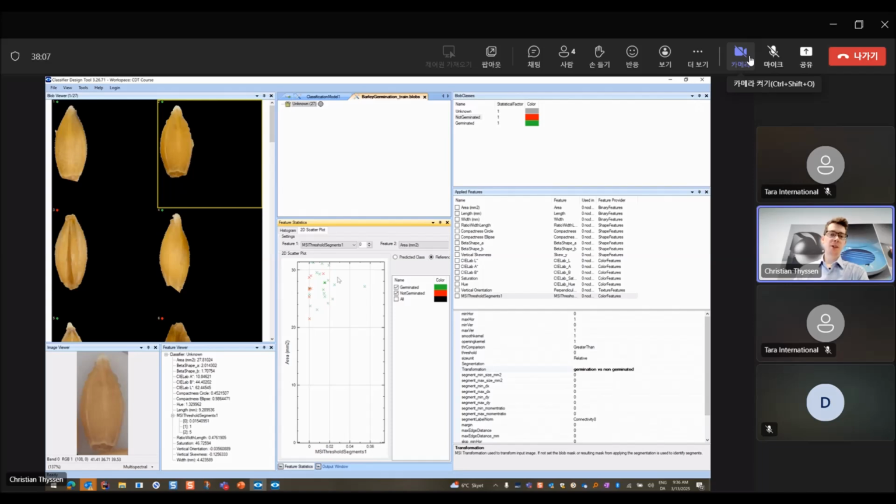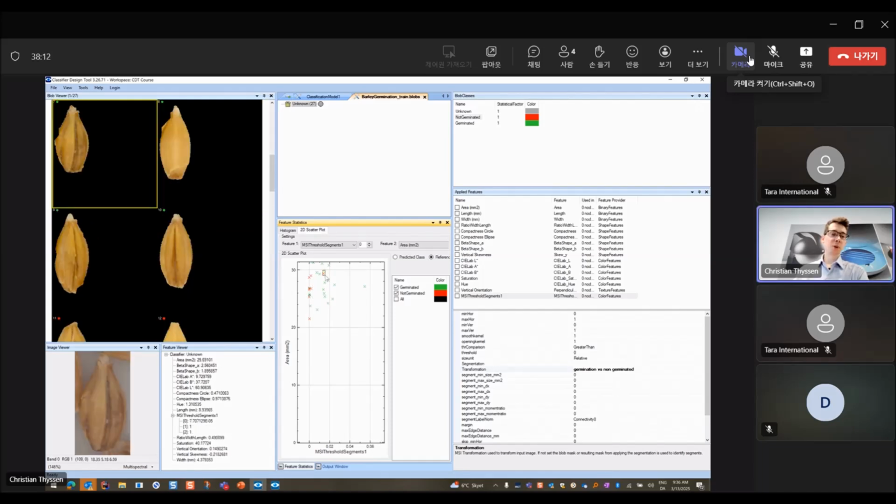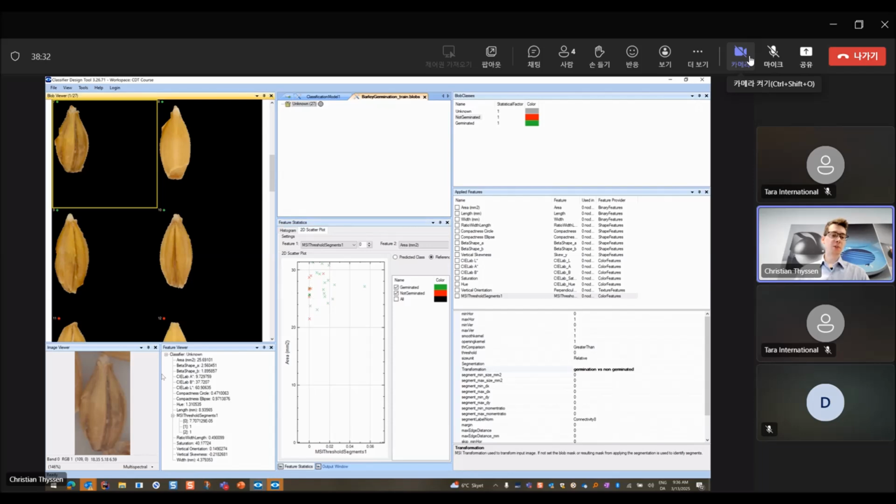So in this case, you see that the feature doesn't work that well because we only trained on 2 seeds. And again, this is a very common occurrence. Initially you train the transformation, and then you'll find some cases where it doesn't work, and then you'll iterate until you get a perfect feature. So here I would choose some of the seeds where we found some signal.